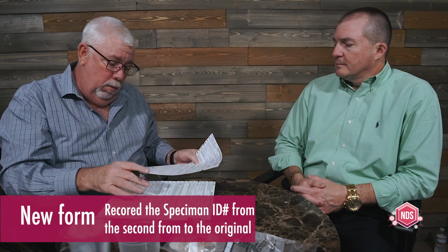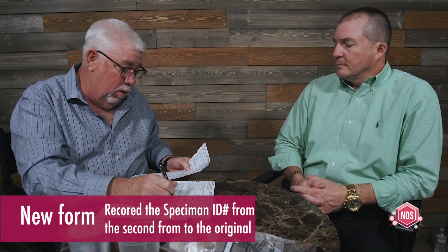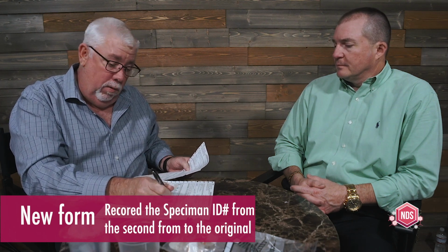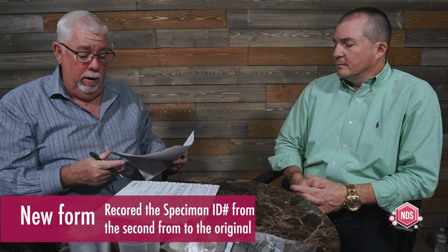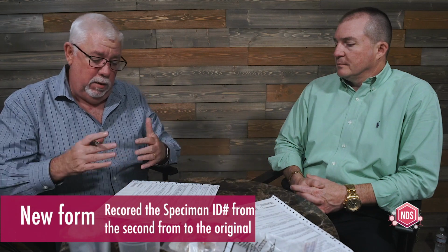And then since there's going to be 1 of 2, we're going to take our next form that we're going to be using, and we're going to record the specimen ID number from the second form on this form so that they cross-reference each other. So that's going to be really important. So simple remark: temp out of range, specimen 1 of 2, and the specimen ID number from the other form.